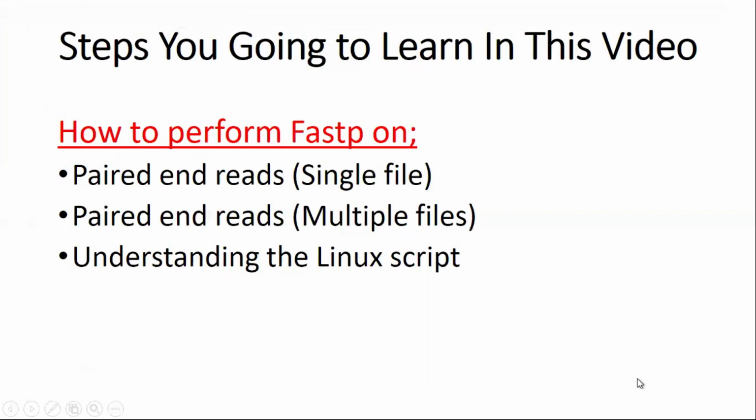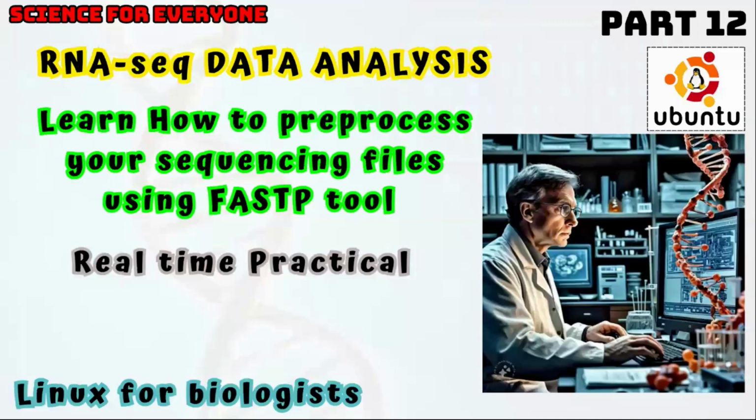I have shown you how to pre-process a single file, how to pre-process multiple files, and I also explained the Linux script. So this was all about today's video.